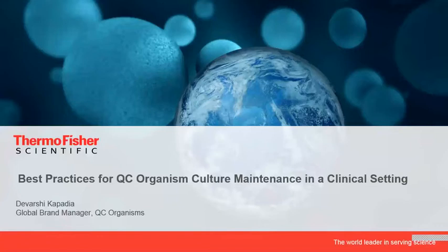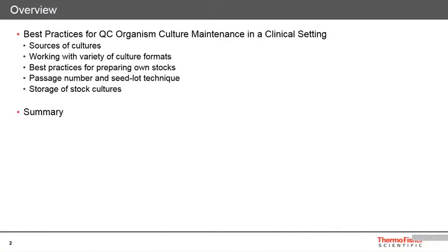I have the pleasure of working with quality control strains for nearly 10 years, and the topic of presentation has always been close to my heart. In this short presentation, we will look into various sources of cultures, the variety of culture formats, and then we'll discuss a few facts on passage numbers, seed lot technique, and best practices overall for culture maintenance.